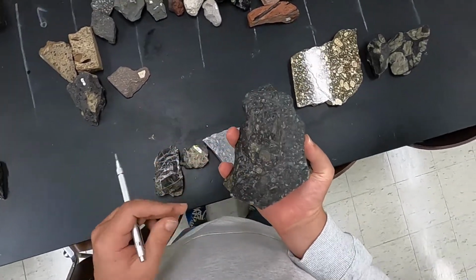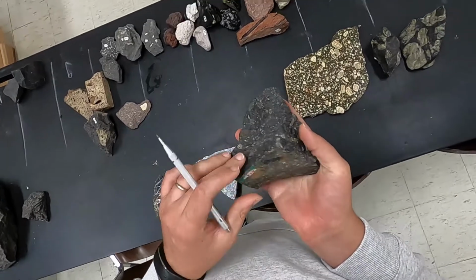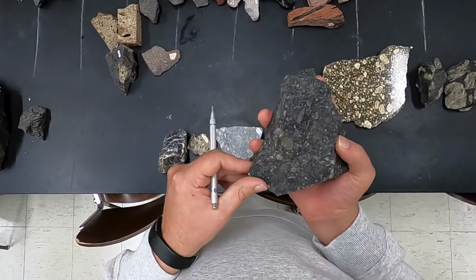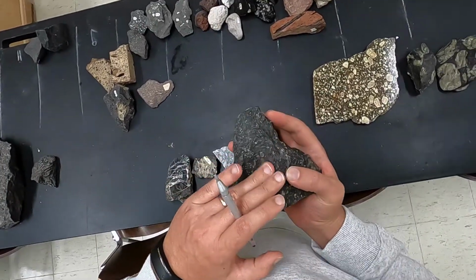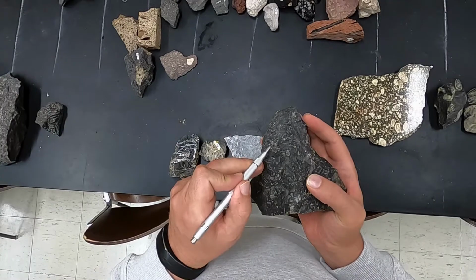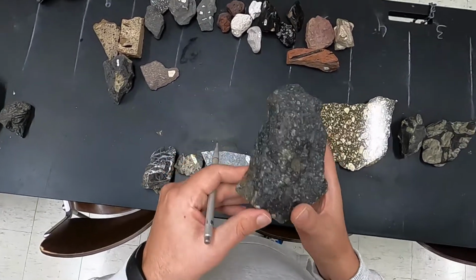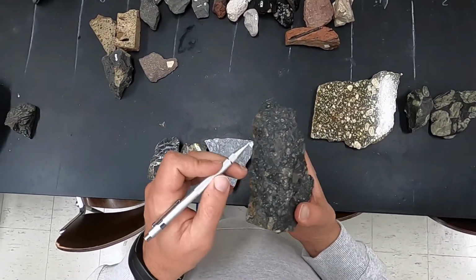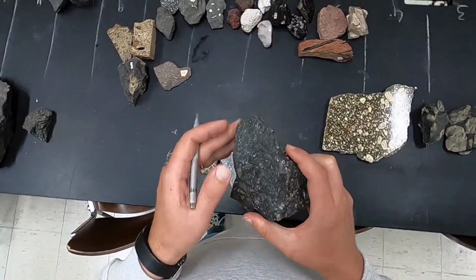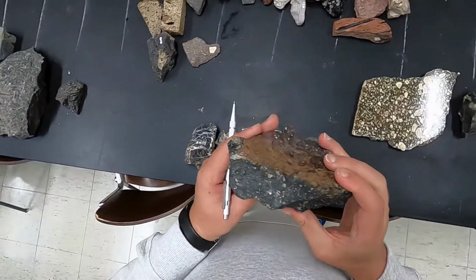I definitely see mostly a very fine grain microcrystalline matrix and some inclusions, and these are quite irregular and have a variable composition. So they look either like crystals or clasts or a combination of them.